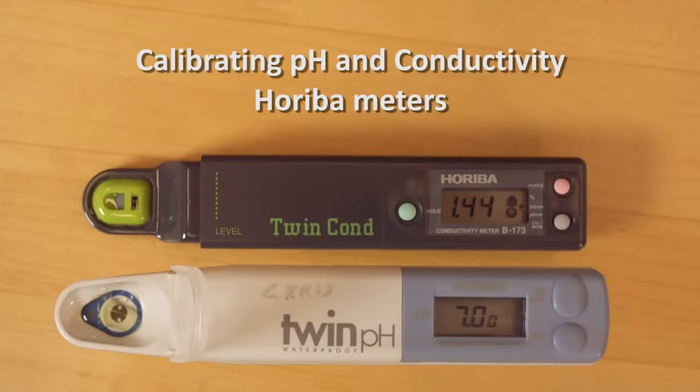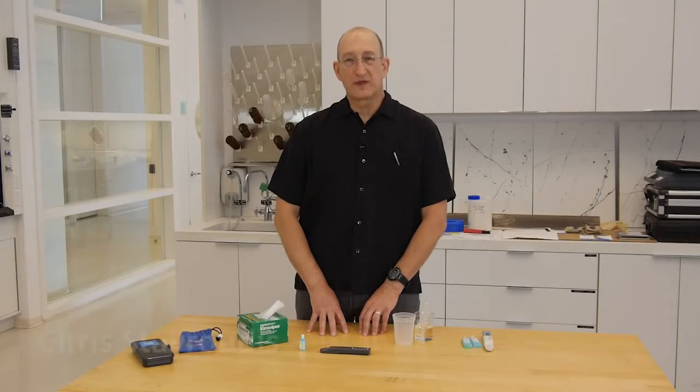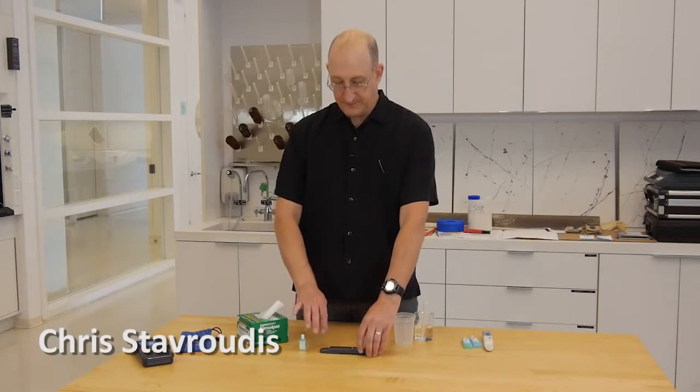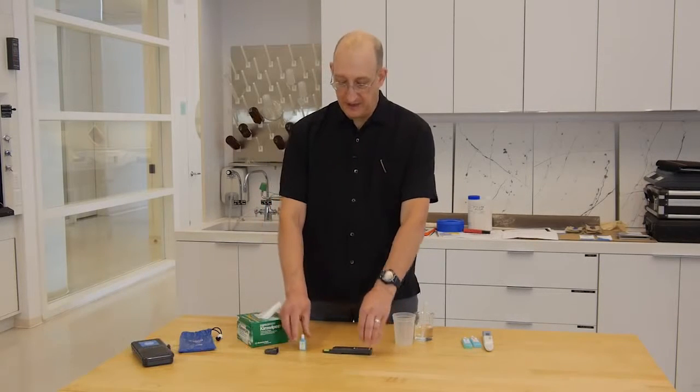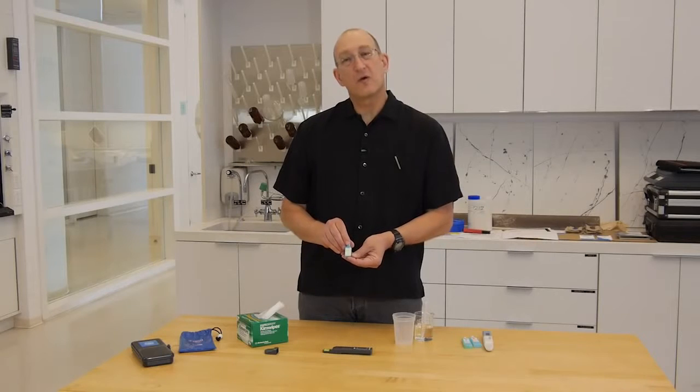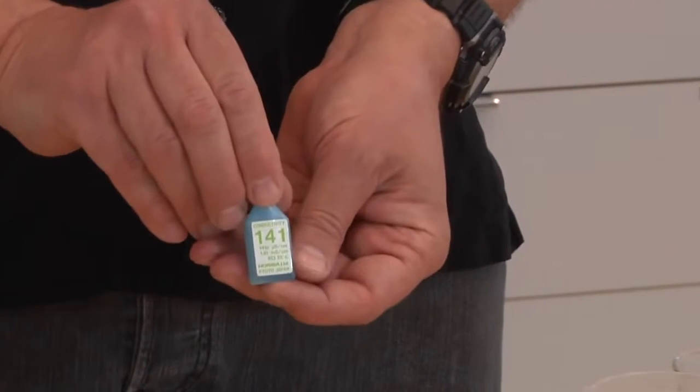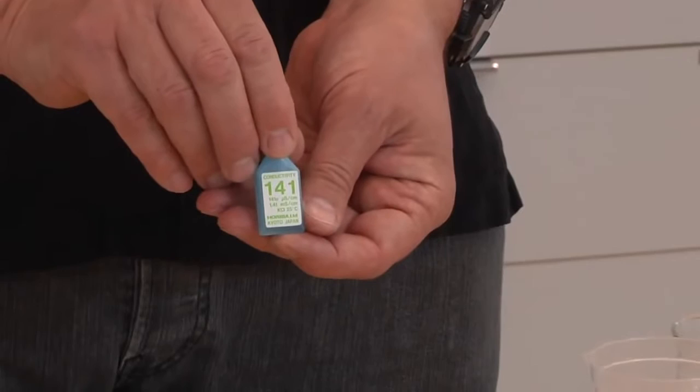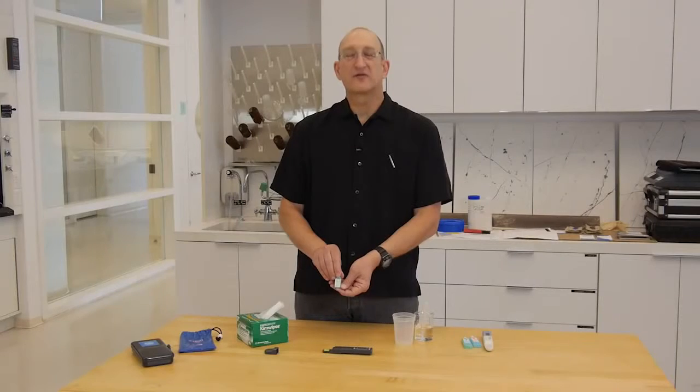To calibrate the Horiba conductivity meter, we want to start with turning the meter on, removing the protective cap, and we'll use a 141 calibration solution, which is 1.41 millisiemens per centimeter, or 1,410 microsiemens per centimeter.